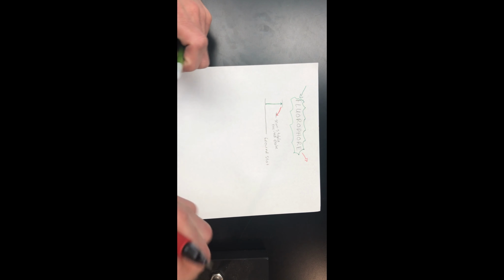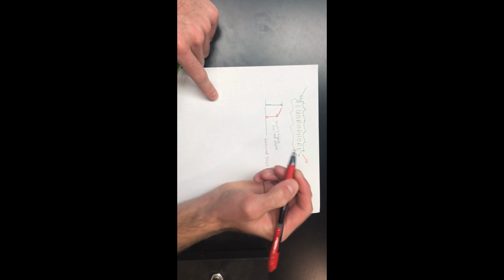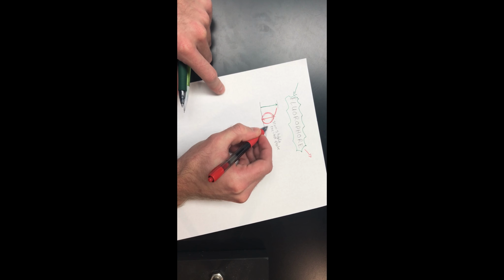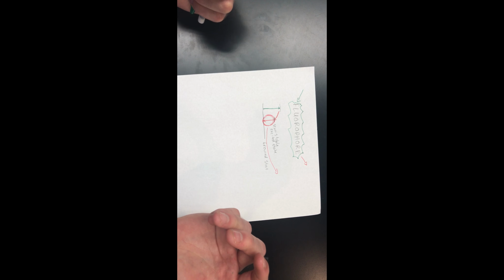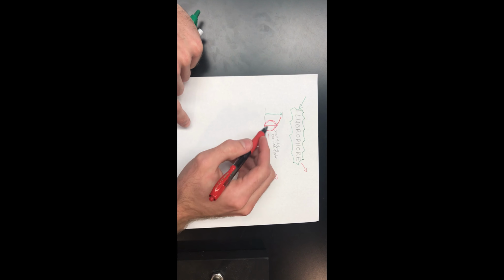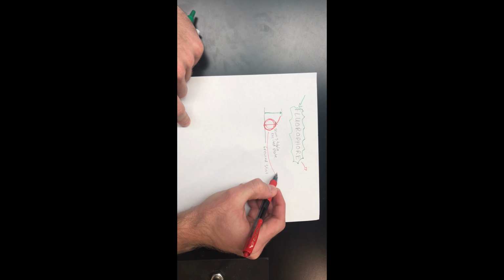Eventually, these electrons will return to their original ground state. And this right here, the energy emitted as light, is what we see when observing our sample with fluorescence microscopy. As a result of this energy loss, energy is emitted in the form of visible light. So we're emitting at this wavelength.